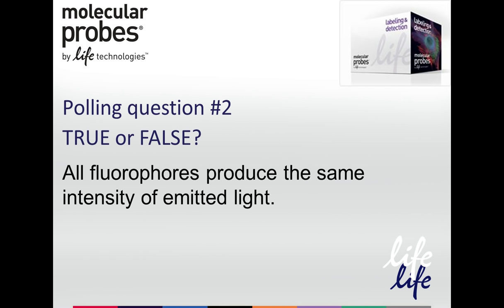All fluorophores produce the same intensity of emitted light. Is this true or false? So you can select your answer now. This is a true or false question.